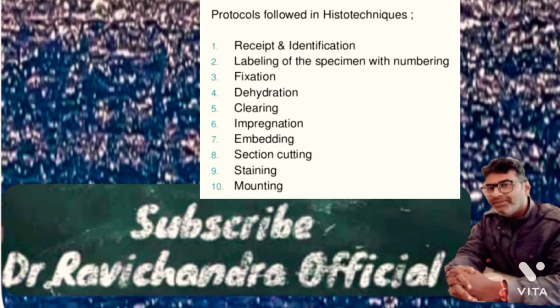EDTA, electrolysis. Endpoint of decalcification. Decalcification is completed if the specimen is floating. Bending of a specimen is possible if decalcification is completed. Inserting a pin or needle is possible if decalcification is completed.